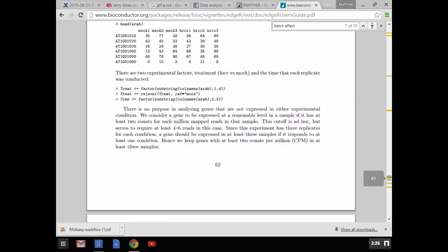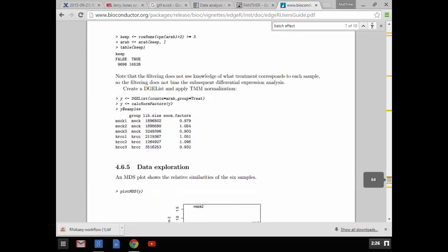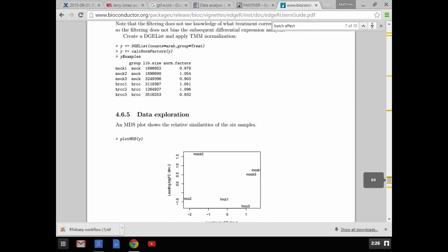between the samples. And then if there is, you say, assume that there is, and I want to see differential gene expression by sample, so only look at the differential by sample and then combine those differentials together. So instead of averaging by condition first and then comparing, it compares within an individual first and then averages those differentials, right? So it just takes the analysis and flips it on its head.